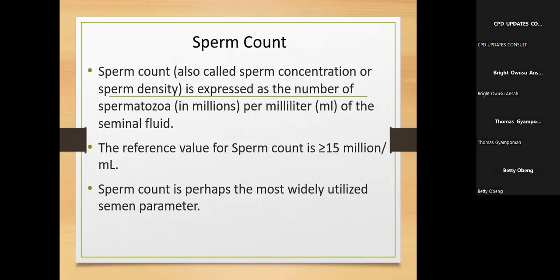That was what I was trying to say at that time. So what about people who have always been around 17, 18, and we said that they're oligospermia? Now, per the new reference, they are not oligospermic, they are normal. So if they are normal and still not getting pregnancy, then they can be reclassified as unexplained infertility. Take note of that.